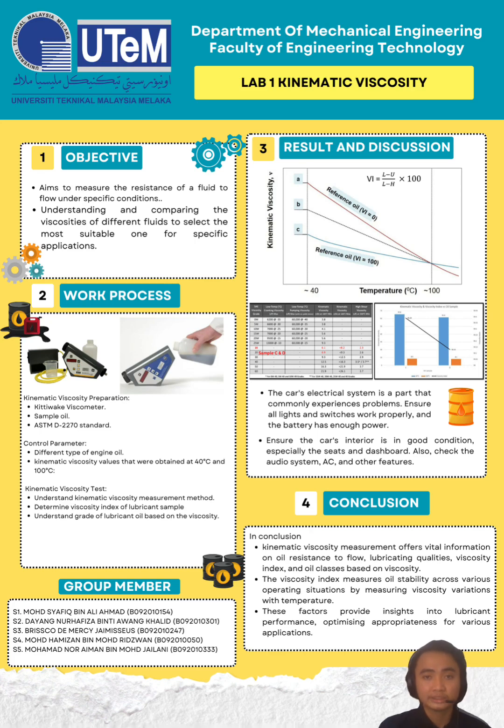For the second main point, the control parameter, we will use different types of engine oil, which are samples C and D, and we can also control the parameter for the kinematic viscosity value that we obtain at 40 degrees and 100 degrees Celsius.